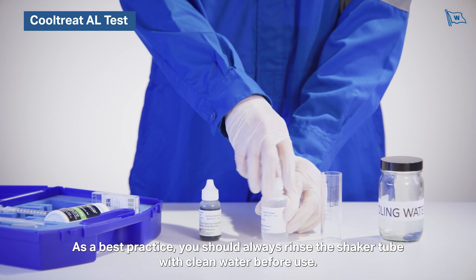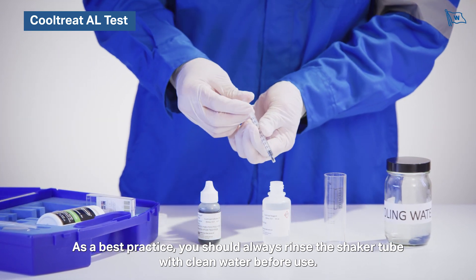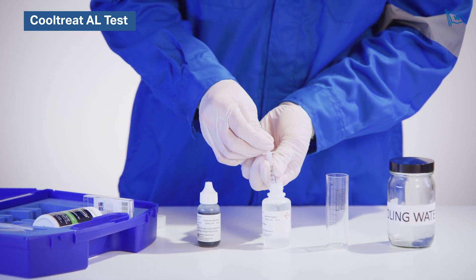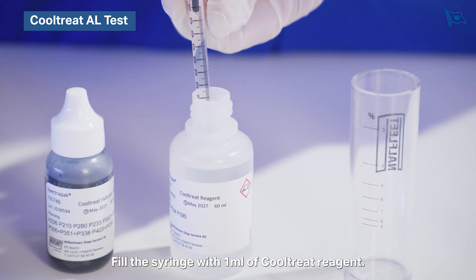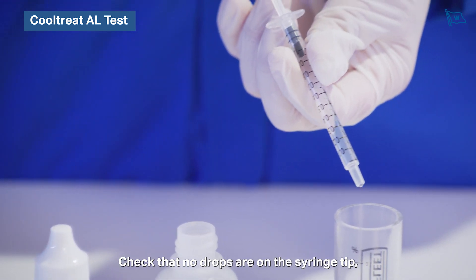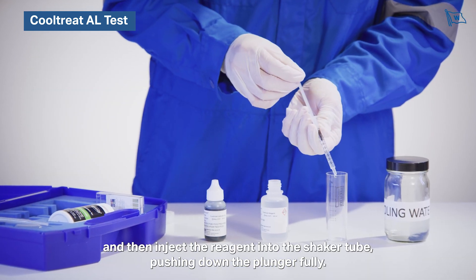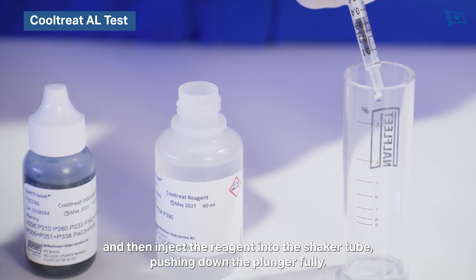As a best practice you should always rinse the shaker tube with clean water before use. Fill the syringe with one milliliter of Cooltreat reagent, check that no drops are on the syringe tip, and then inject the reagent into the shaker tube pushing down the plunger fully.